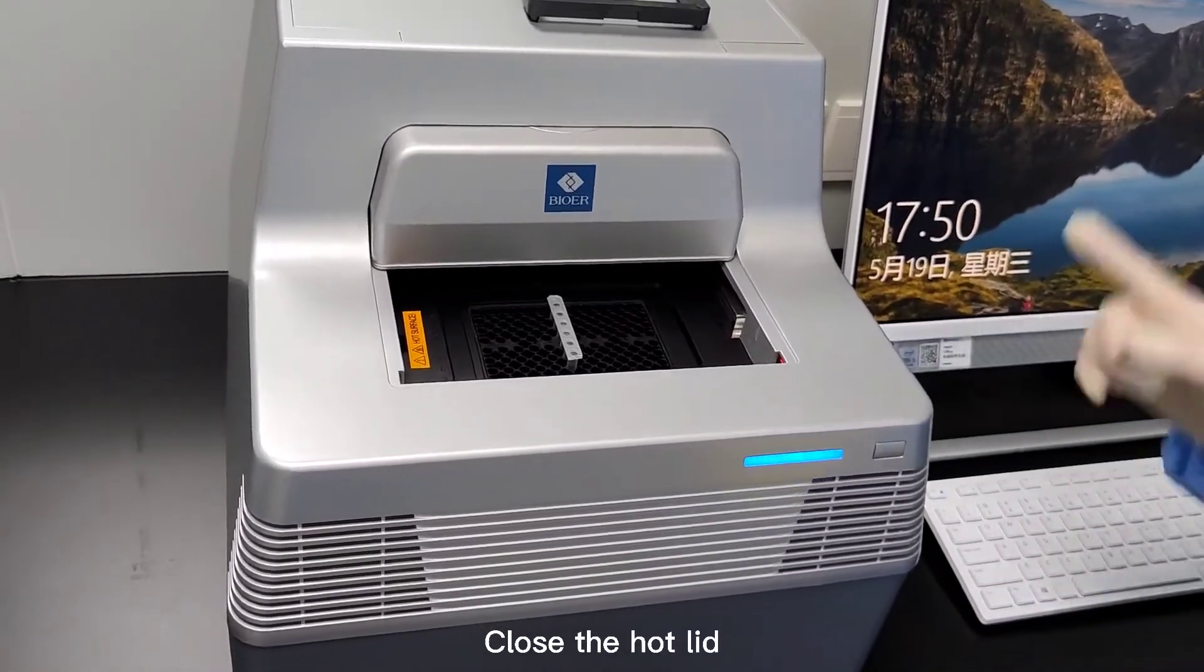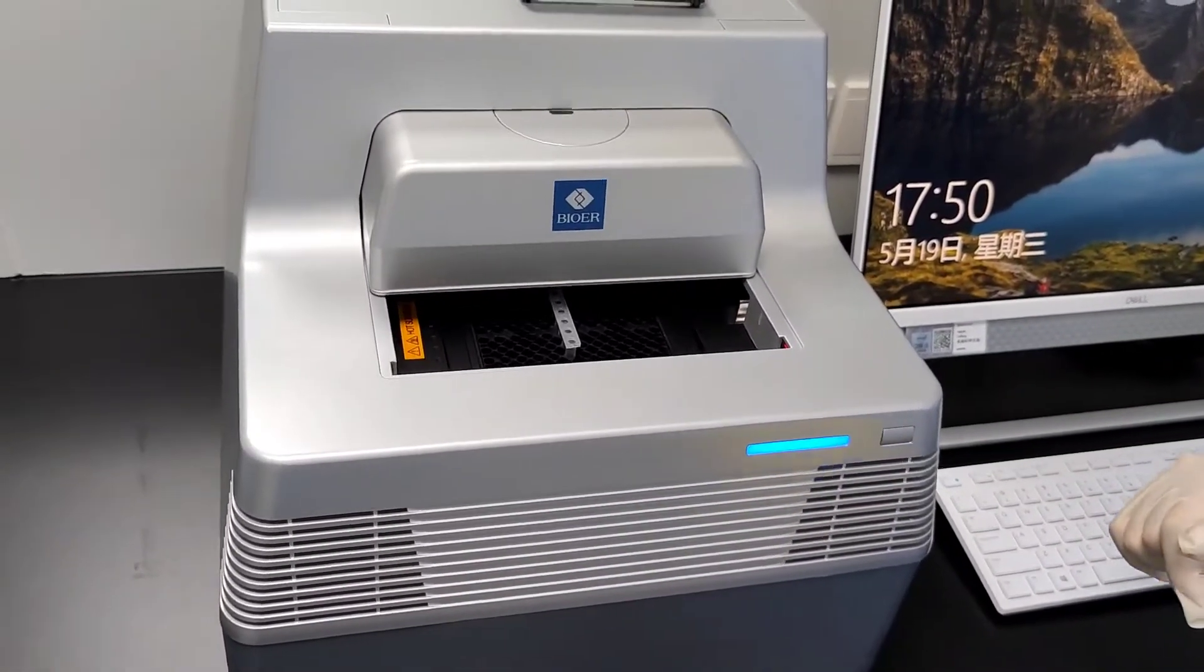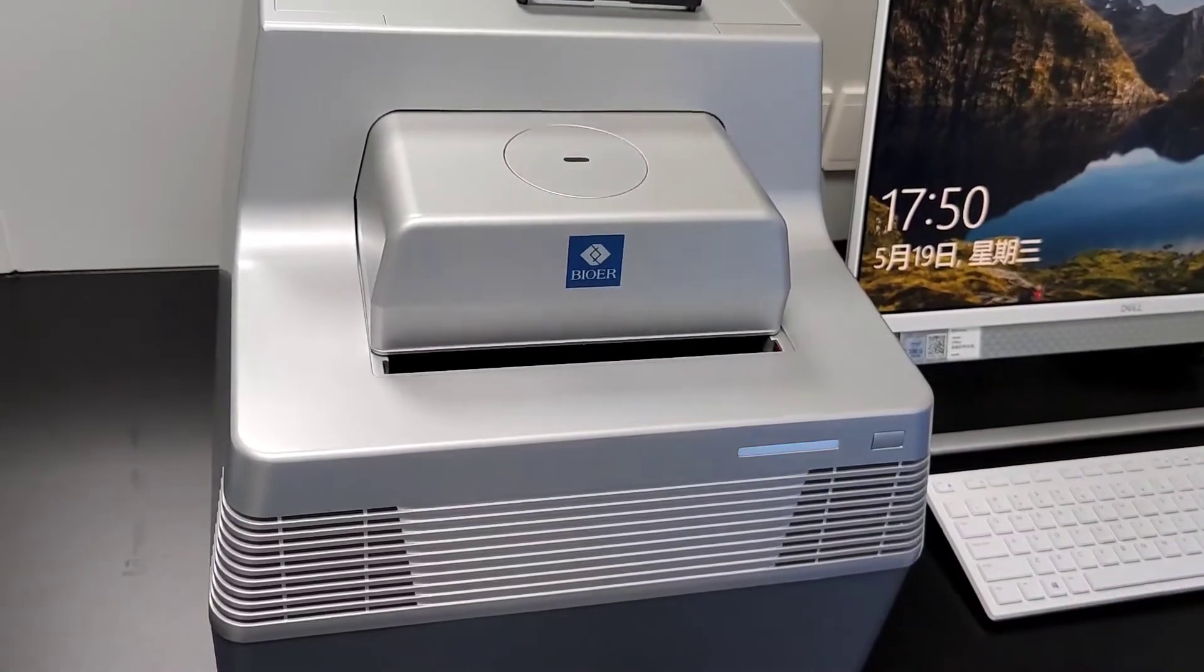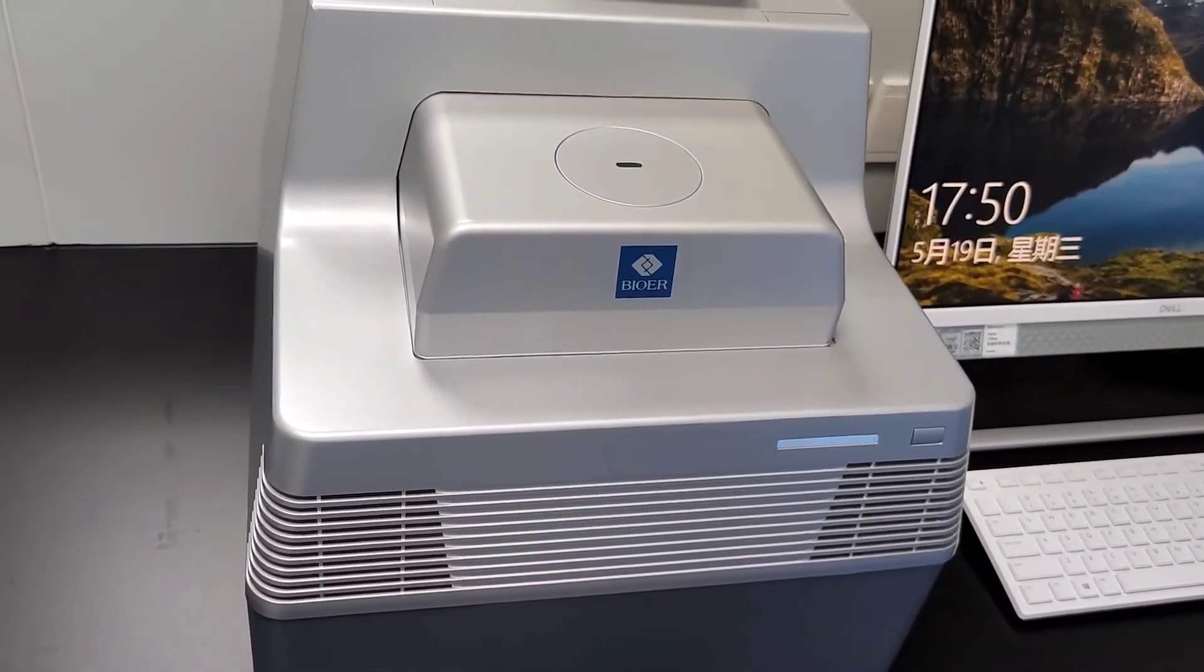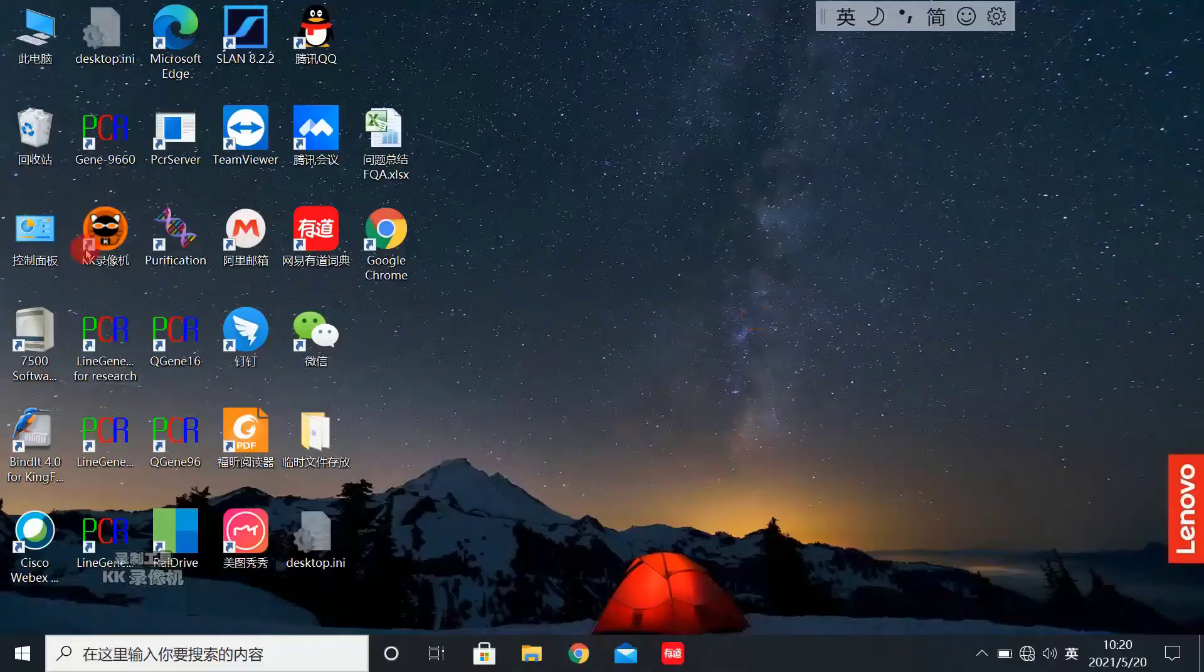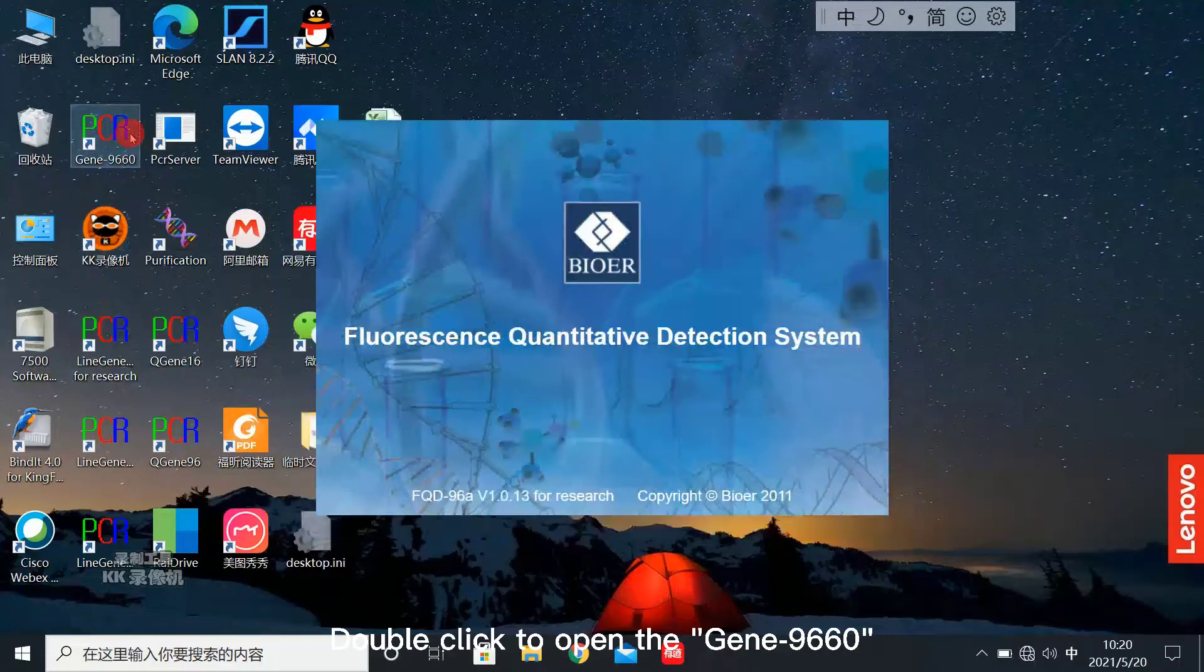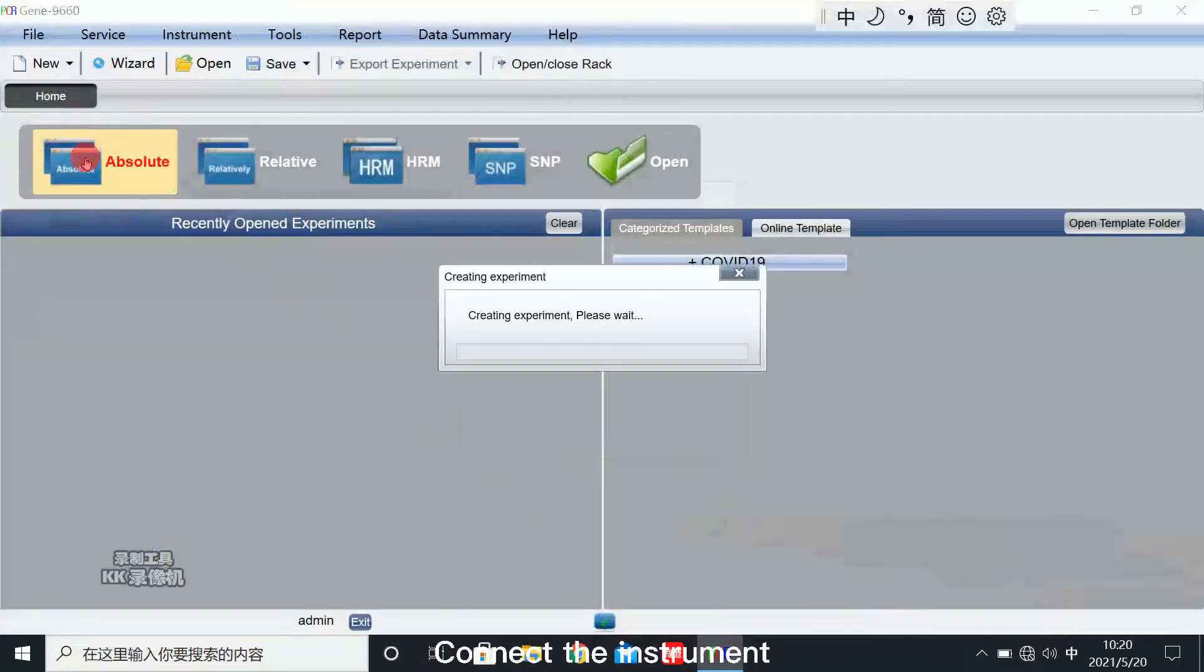Close the hot lid. Double click to open the Gene-9660. Connect the instrument.